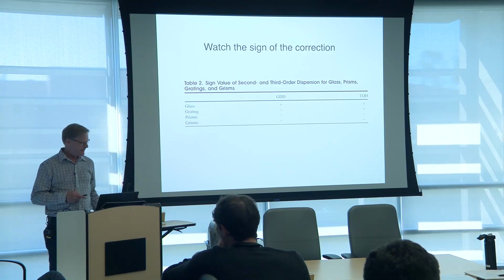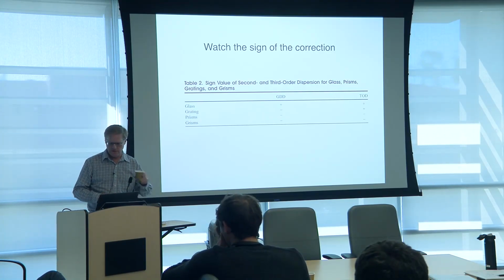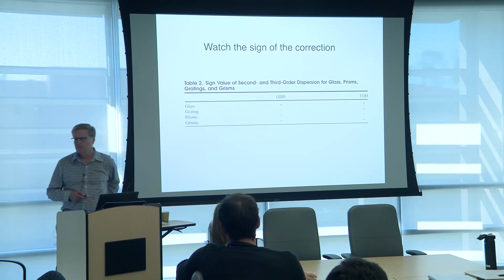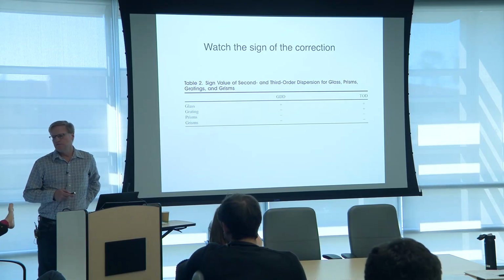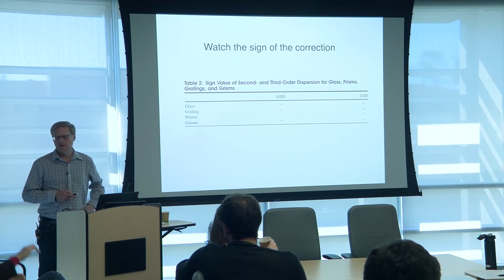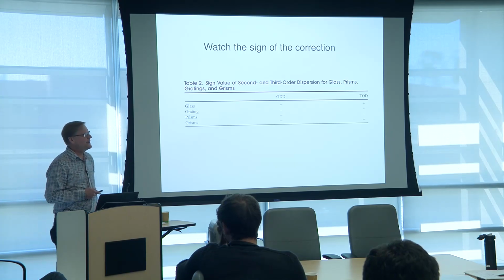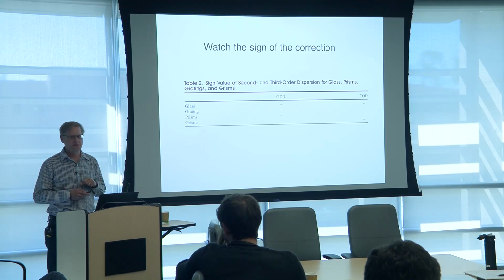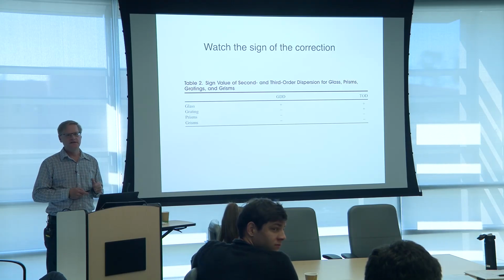Before you move to the next slide, is there a standard rule about the group delay and third order dispersion, for instance, like Bragg layers, when you make a filter, for instance, you shoot your beam through an excitation filter. Is there a significant dispersion that those devices add? Yeah, there can be, I guess. Can you go either way, or is there a rule where they can go both ways, and they're usually polarization dependent? Oh, yeah.